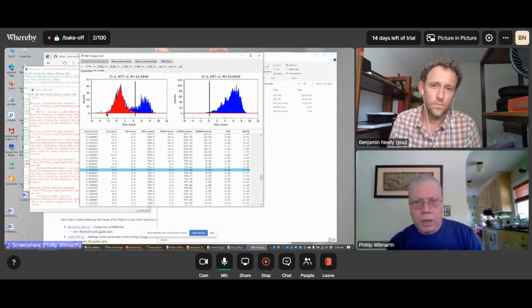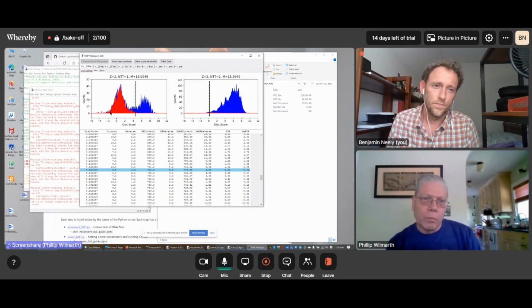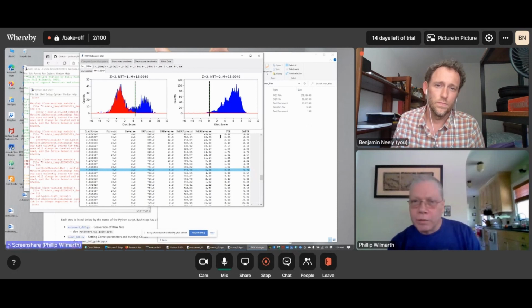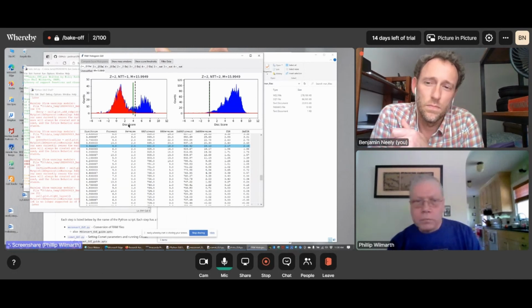Sometimes in samples where you don't have as many identifications, or the experiment isn't such a large scale one, then you might want to set a lower threshold, maybe 2 or 3% FDR or 5% FDR, and you can adjust those thresholds accordingly. It's the same basic thing. You click on the spectrum, you click at a different place where you want the FDR to be, and then if you hit the return key, you'll move the threshold to the green line.